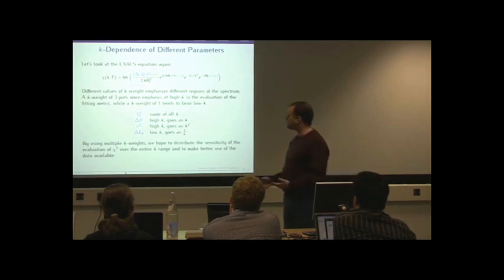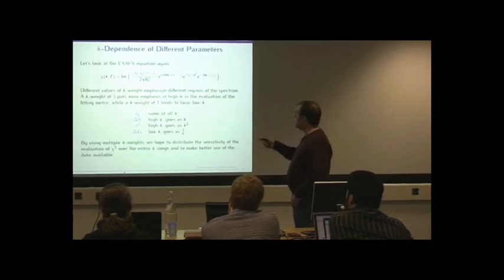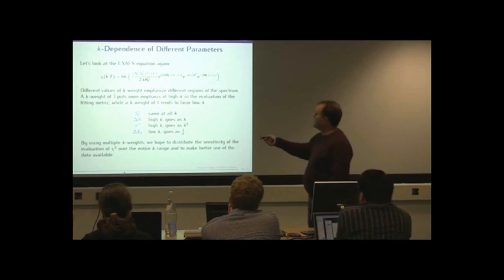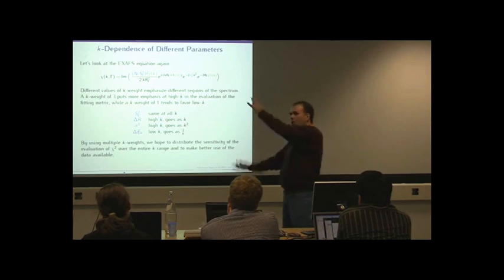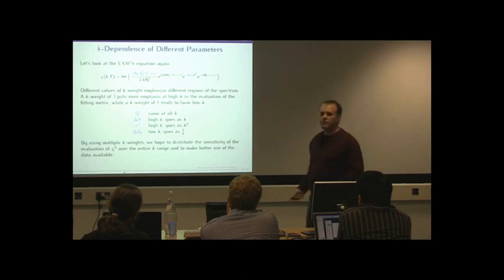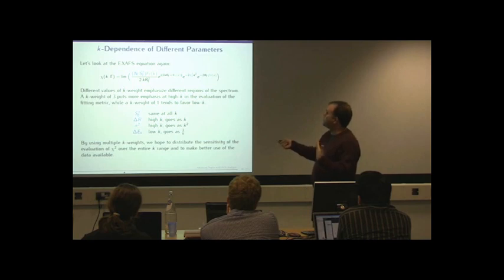So if we evaluate chi squared using a k-weight of 3 in the Fourier transform, multiply chi of k by k cubed, we blow up the high k end of the data, and a misfit in sigma squared contributes much more profoundly to chi squared than, for example, S naught squared, which equally affects the whole range of data.